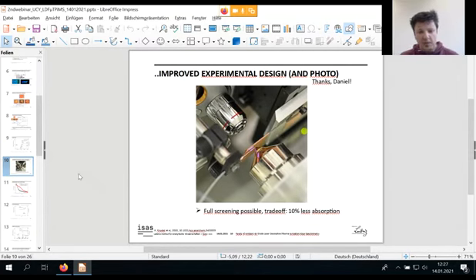So the first design I've shown you was that we had the laser applied from the top side. One drawback of this setup was that we were not able to fully screen the substrate, so we had to slice it each row, which is of course not really nice if you want to screen several analytes, right? Because you have to use a wafer saw at a time.